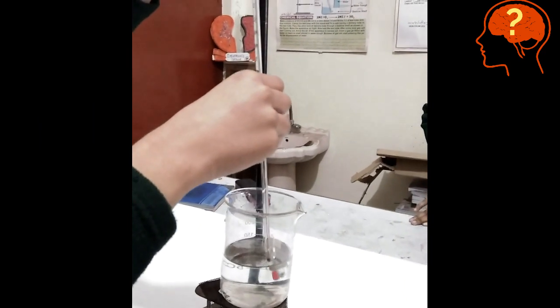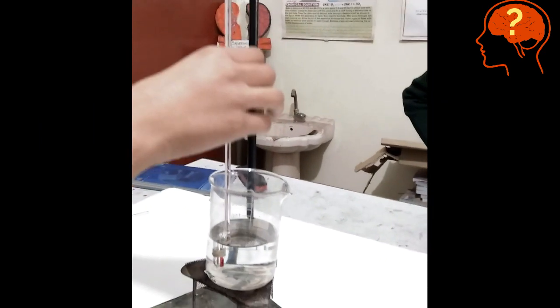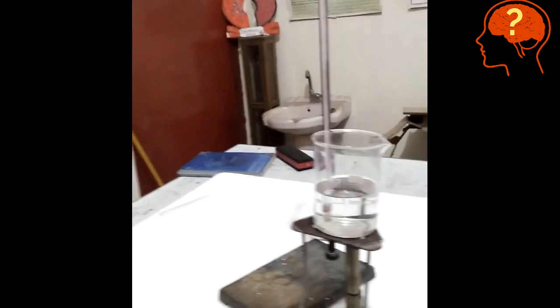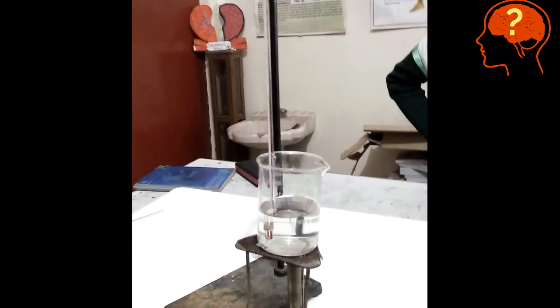Now place the thermometer having fusion tube in a beaker containing water. It should not touch the sides and it should not touch the bottom of the beaker. And the top of the fusion tube should be outside the water.